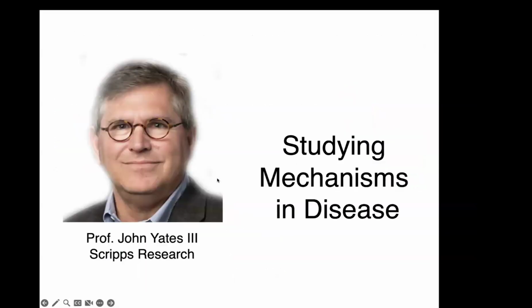As we transfer over to Bill Webb and Elizabeth, I just had a quick question for you about your presentation. The one thing I was surprised that you didn't cover is that cystic fibrosis is very much characterized by lots of disulfide bridges, and you didn't really talk about that at all. I was wondering what role the mass spectrometry technologies that you developed could play in helping decipher some of the complexity of those interactions.